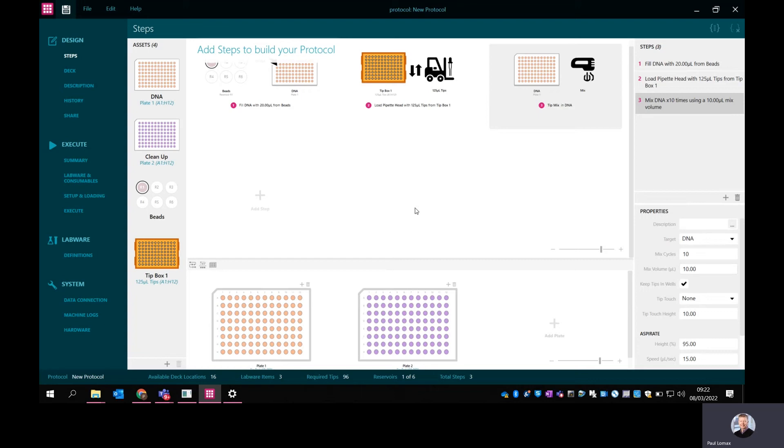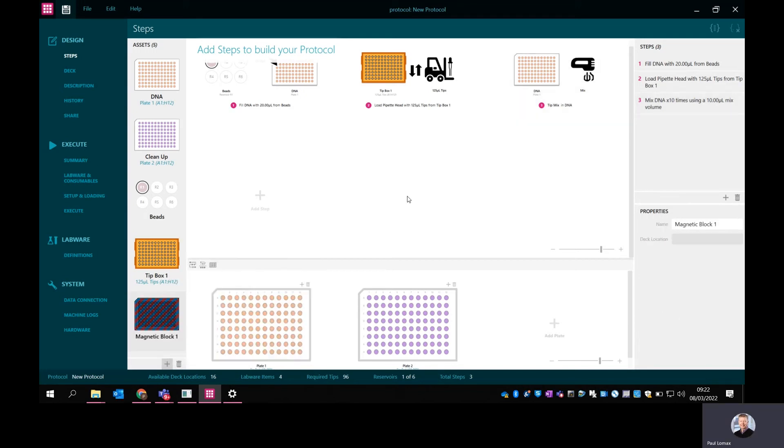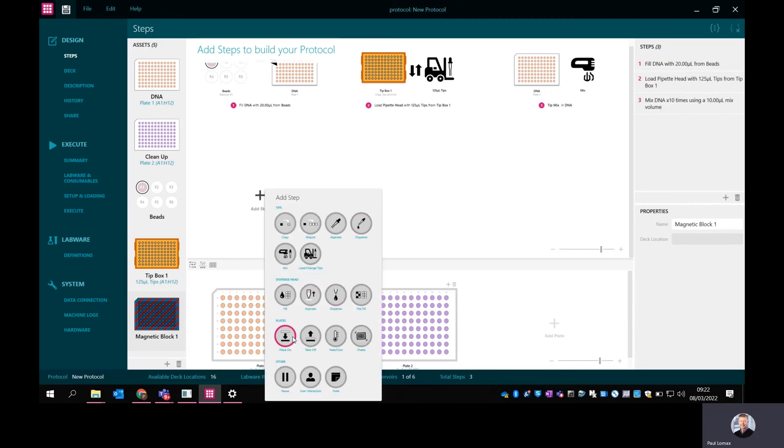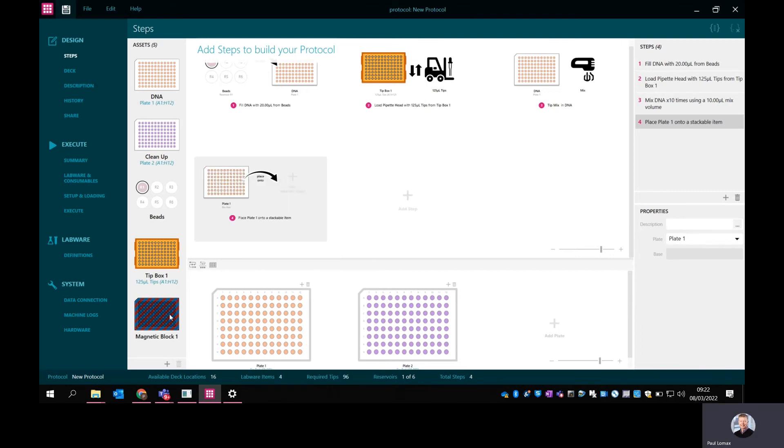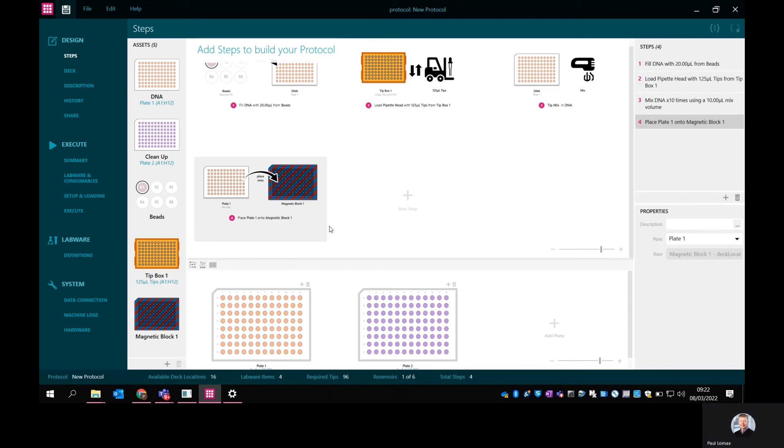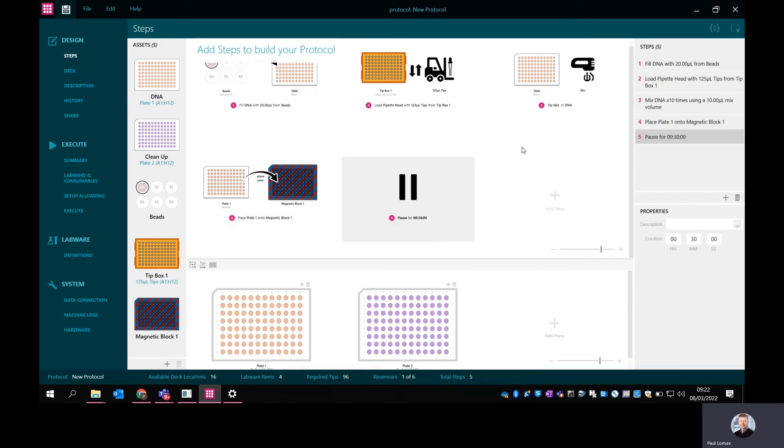So I've now mixed. I now want to place that DNA plate onto a magnet. I'm going to add a magnetic block here. I now want to do a place on function - I'm going to place the plate onto the magnet. So I'm going to take that DNA plate and drop it onto the magnet. Then I'm going to put a short pause in there. That's got a default time of 30 minutes, which is a little bit long for what I want here. I'm going to put 30 seconds in there.